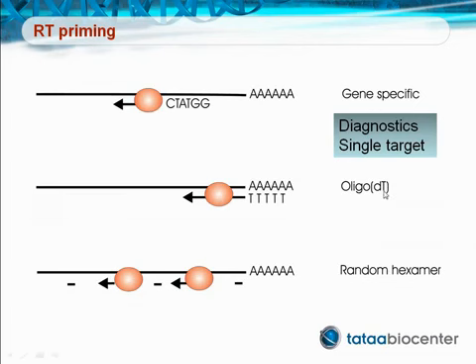Oligo-dT primers can be used to reverse transcribe RNAs with A tails. Most eukaryotic RNAs have A tails. Advantages are that mRNAs are enriched in the cDNA population and that priming bias is minimized. A disadvantage is that the reverse transcription may not reach the region targeted by the qPCR if the RNA is fragmented.